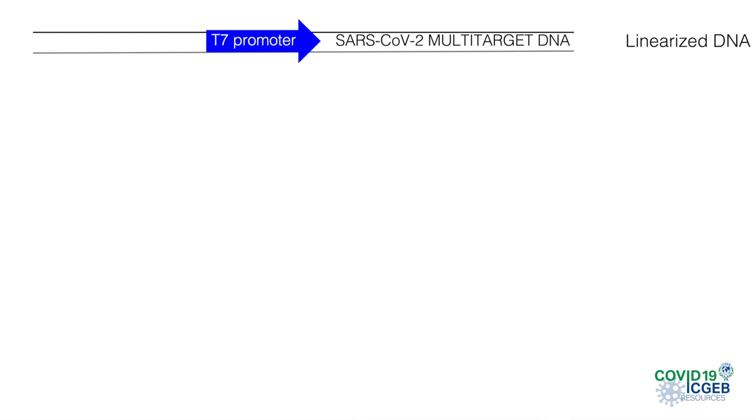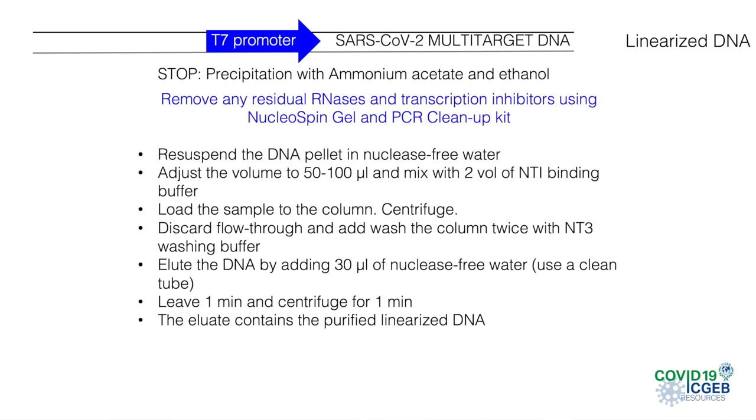We now need to stop the reaction, precipitate the DNA, and eliminate residual RNases and other inhibitors that may be present in order to avoid RNA degradation in the transcription step. Purification can be done using a specific kit — there are many of them on the market. Here, we will use the NucleoSpin Gel and PCR Cleanup Kit from Macherey-Nagel.